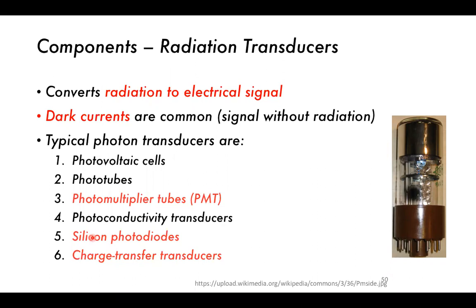But basically what we're doing here, as I've tried to express to you as much as possible, is that what we record and what we use to get our signal is electricity. What we want to measure is absorption, but that's quite hard. So we measure it kind of, what do you call this?